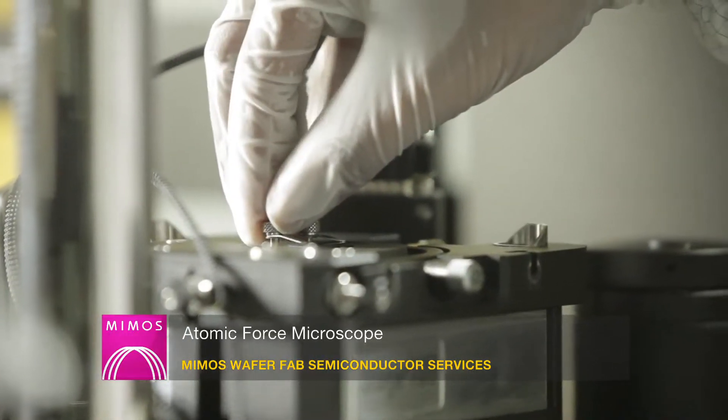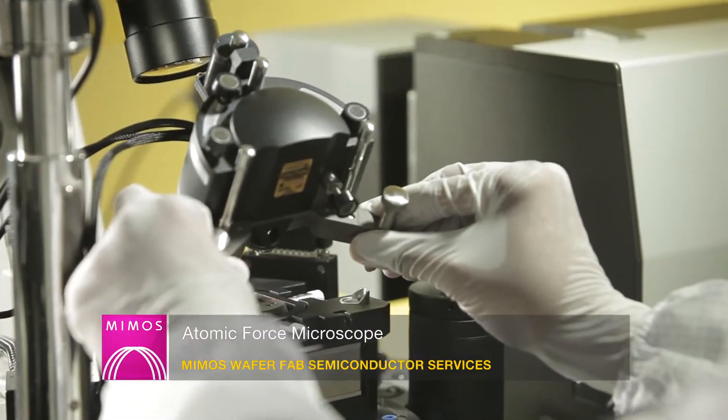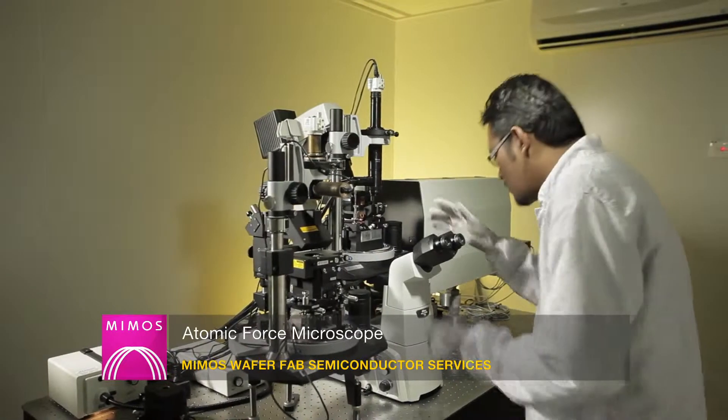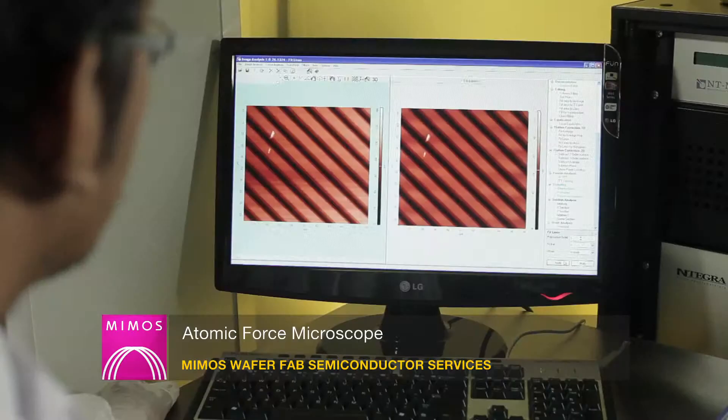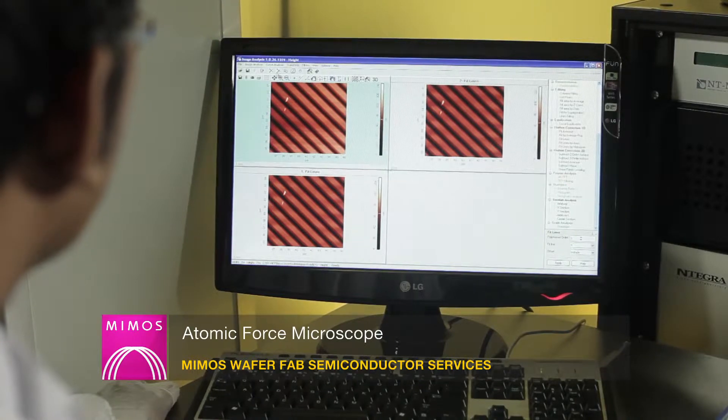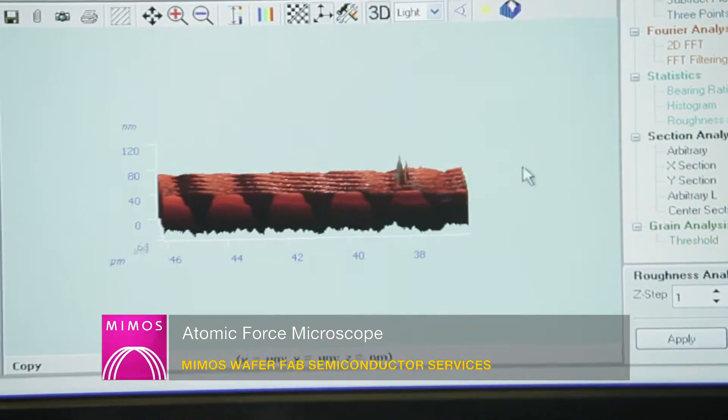Atomic force microscope is a very high resolution type of scanning probe microscope to give 3D imaging profile for topographical information and a very useful tool for surface roughness analysis.